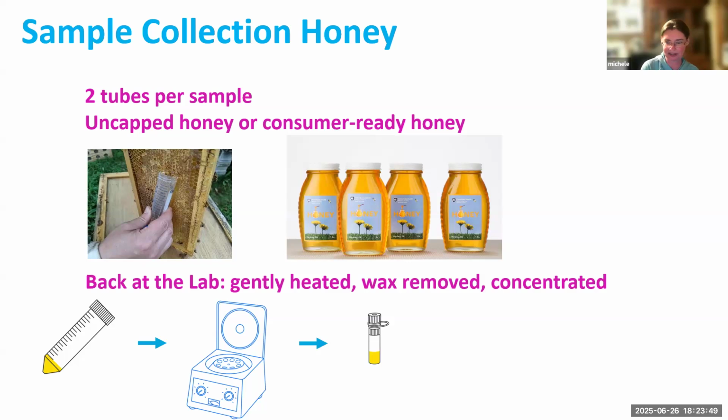Once I get the samples back at the lab, I warm them up. My daughter loves my crazy, it's not a water bath, it's a bath that has aluminum beads in it. So she's just riveted. I'm like, each of those beads is a fortune. Leave them alone and don't touch them. But warming the samples in my lab is really interesting to my 7-year-old right now. The samples are heated, and if there's wax in there, the wax comes right off.